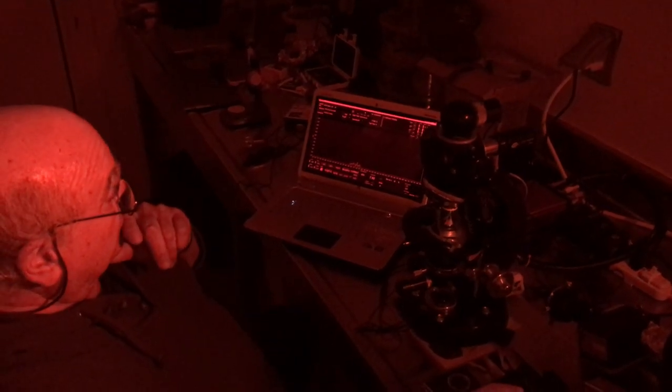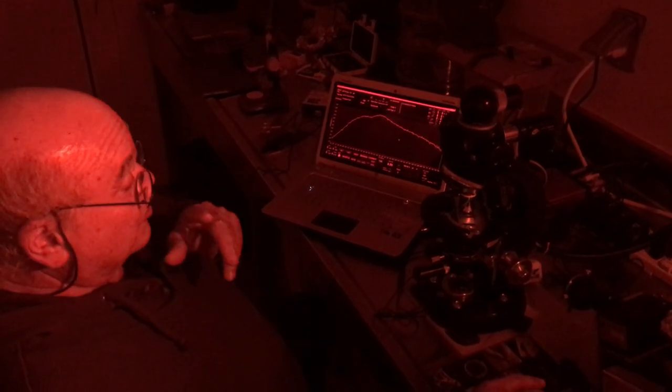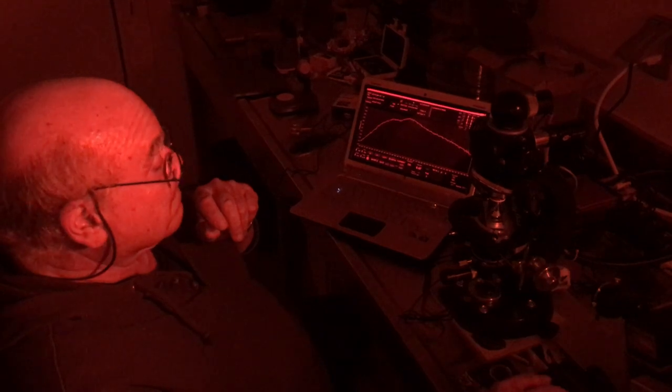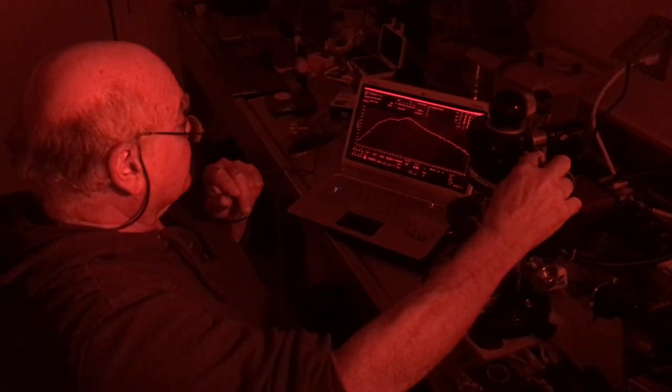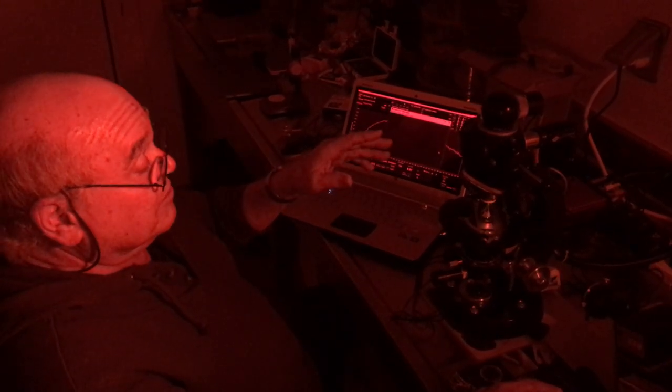One of the problems we're having right now is because of the light necessary for filming. The baseline unfortunately wasn't accurate because of this red light coming on. If the photomultiplier — the detector — gets too much light, it won't work. So let's try this again.